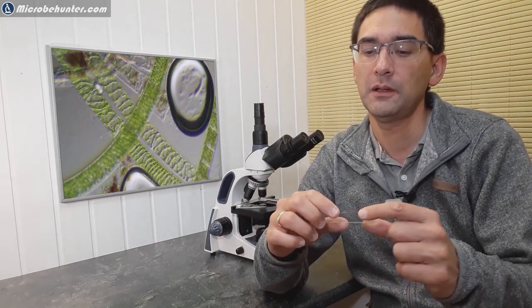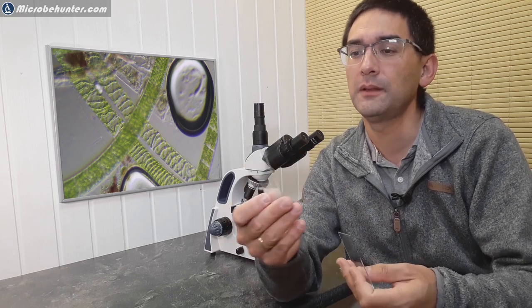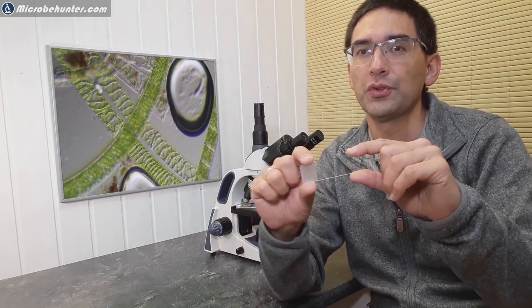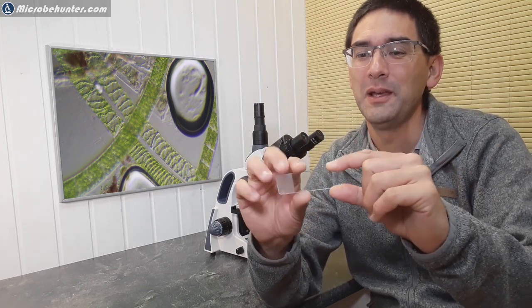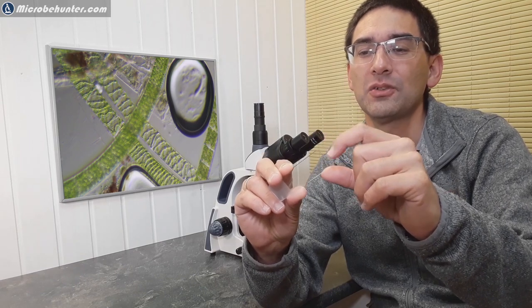So but I do have another recommendation, if you want to play it a little bit safe. I've got some slides here. If you're a little bit worried about injuring yourself, then you should probably buy slides that have ground corners. So you see, you cannot see that quite well because it's too far away. But here, the edges here are diagonally cut, so they don't chip so easily.